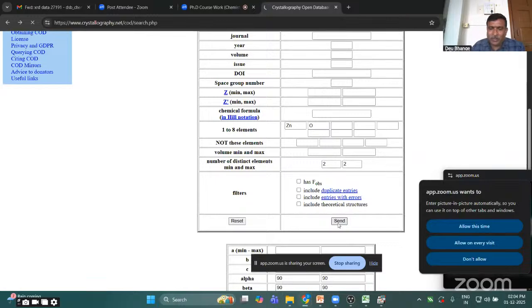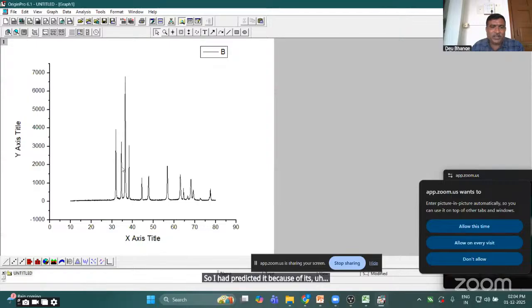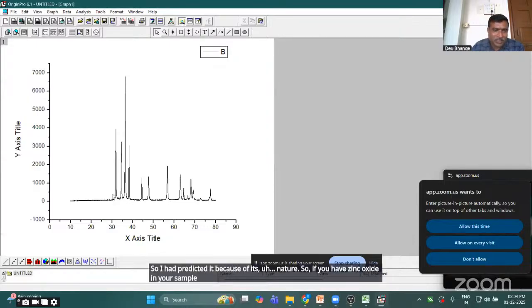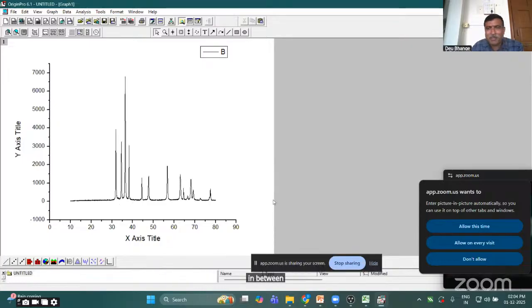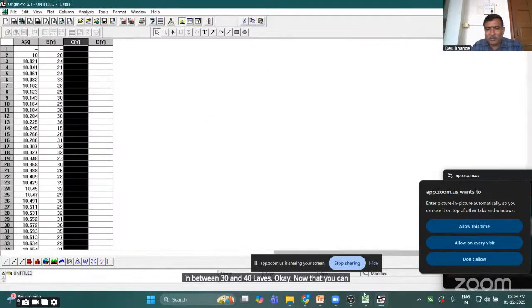Now we will go back to this website, and now we will change our search. Zinc oxide, it is there. Now you go back. So I had predicted it because of its nature. If you have zinc oxide in your sample, you can see three peaks between 30 and 40 always. Now that you can get from your experience.